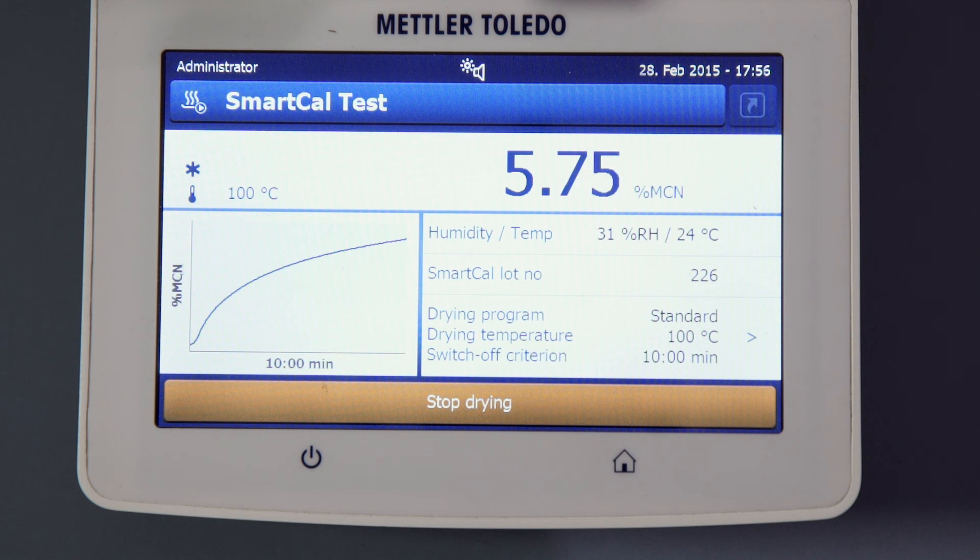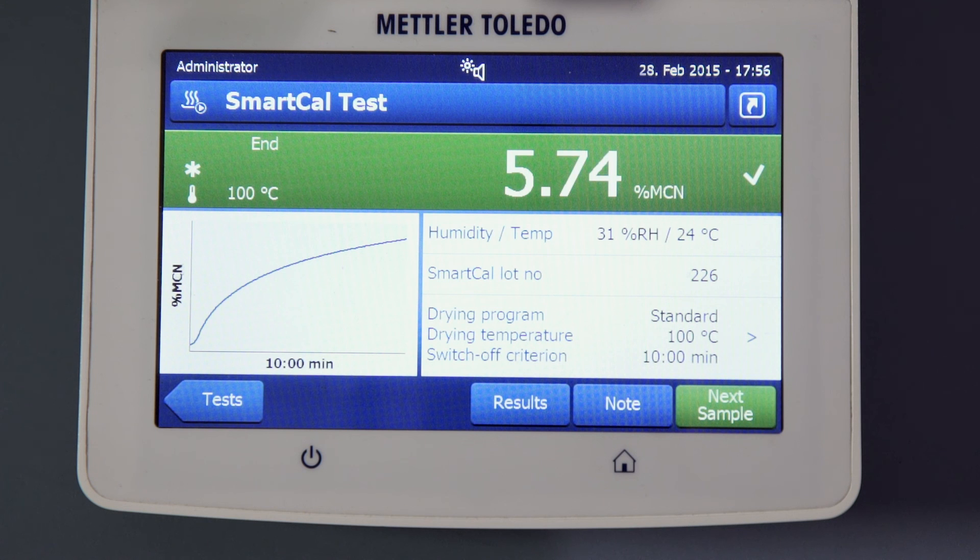After 10 minutes the result is displayed and the test successfully finished.